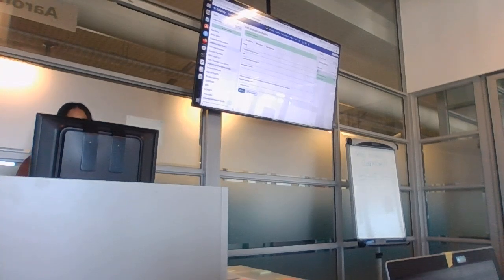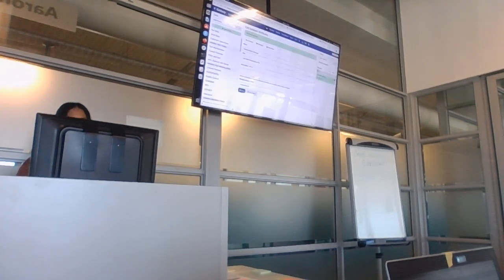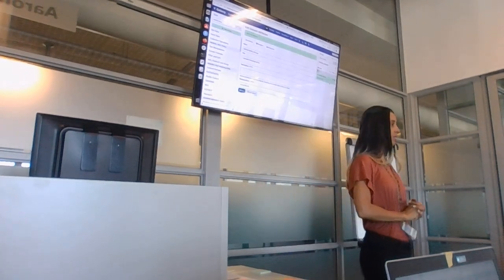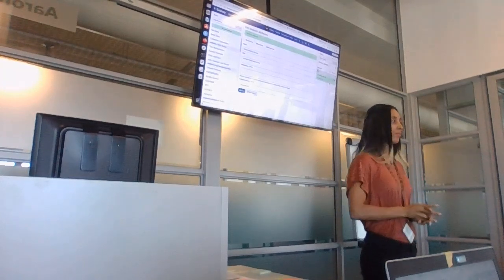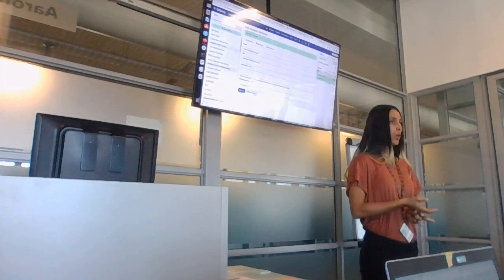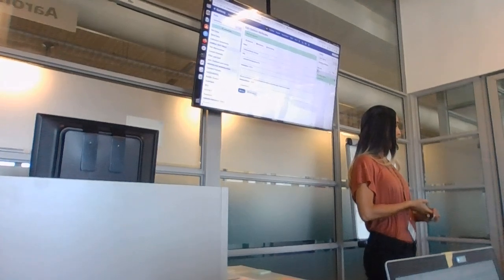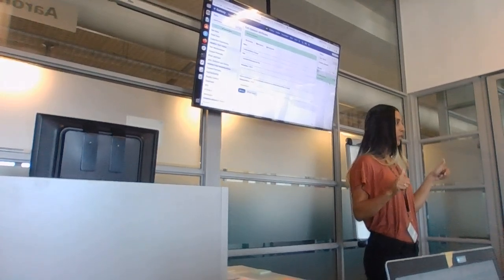Okay, so let's build a very simple workflow with this dataset. We're going to run FastP. How do you run FastP on your dataset? You should know, or you can figure out. FastP is a tool. So Islamia, in Galaxy, where do you find FastP?